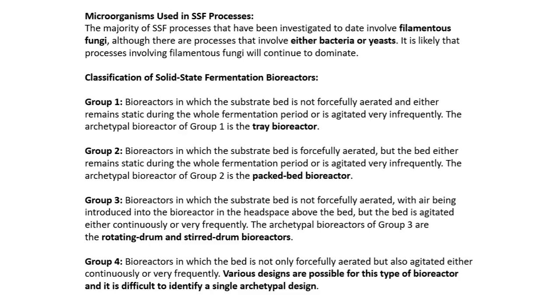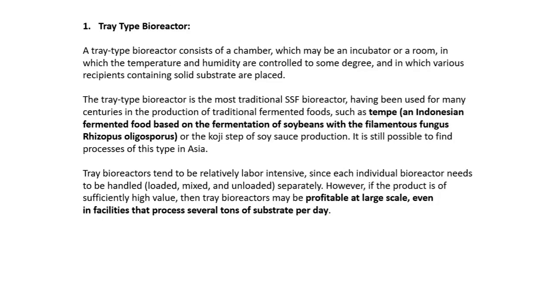Here the head space is not clearly defined, because it depends on the type of the bioreactor. So the difference between group 3 and group 4 is that the air is supplied to the head space. This point is very important. That is the only difference between group 3 and group 4. I hope you understood. Next, we can go one by one.